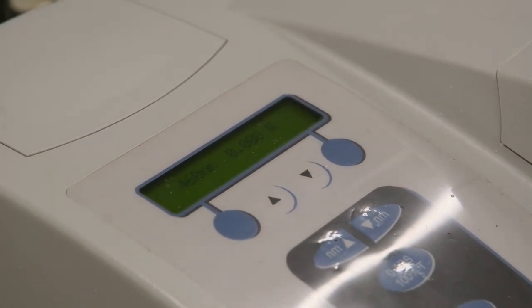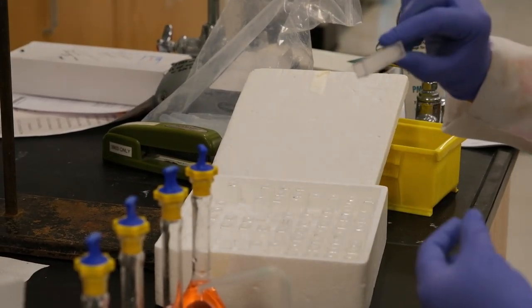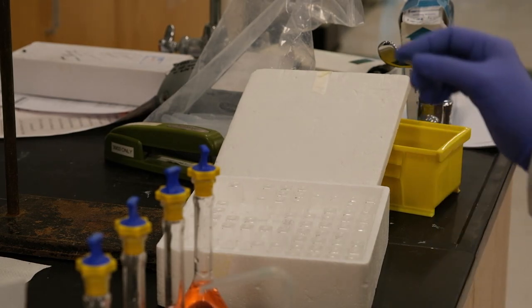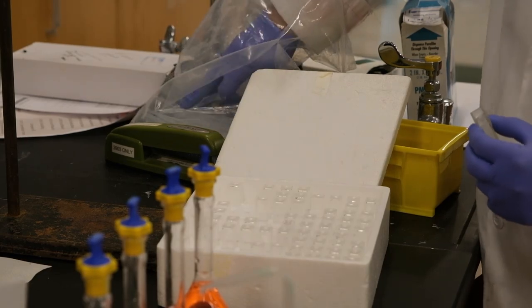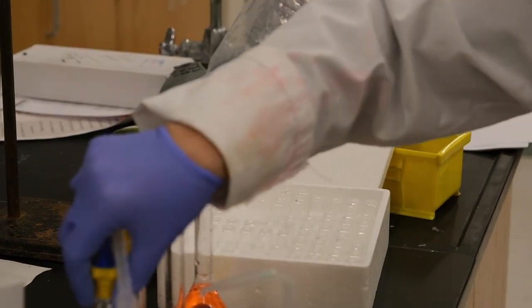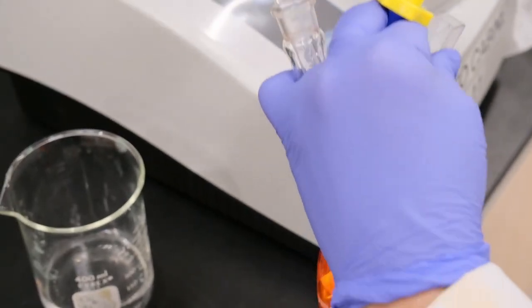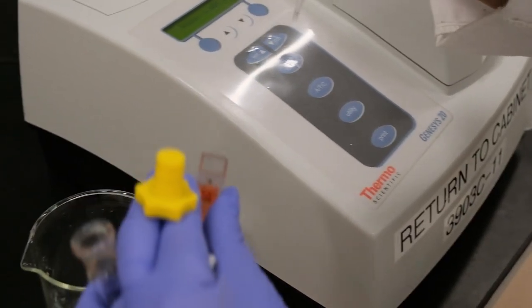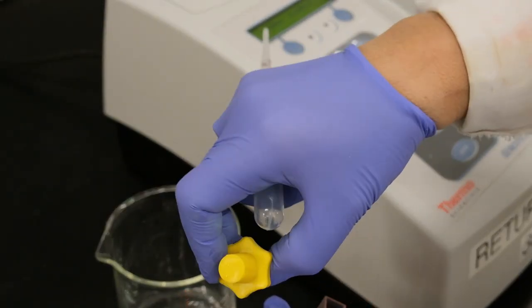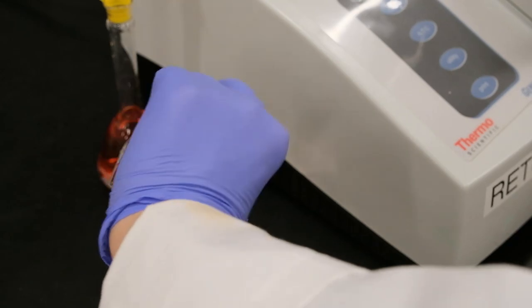Once you've done this, you take a dry cuvette. If you don't find it dry, don't worry, because you're going to condition your cuvette with the highest concentrated solution. So let's do this. Let's take the highest concentrated solution, fill it up with the 8 milliliter solution that we already mixed, and rinse it.